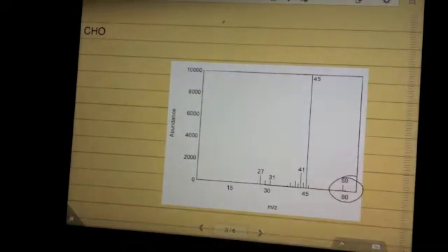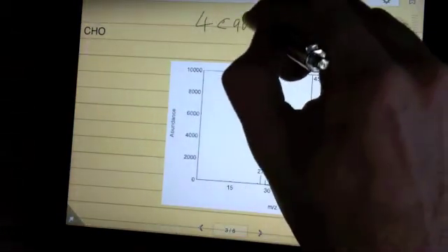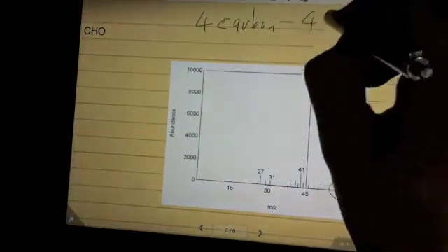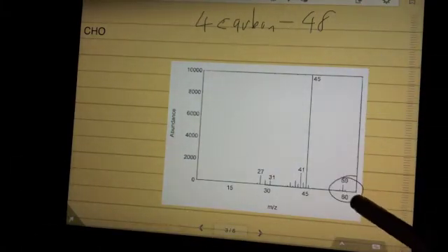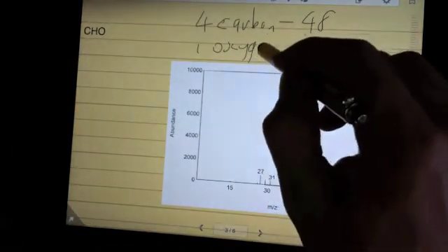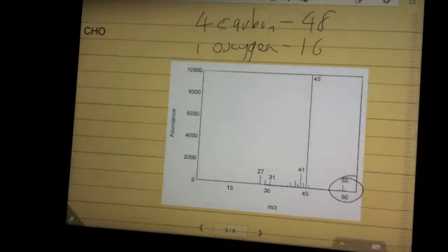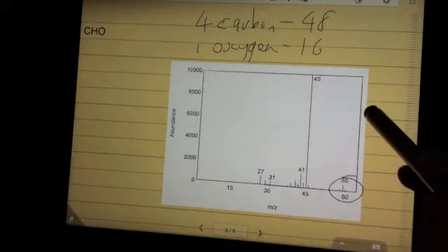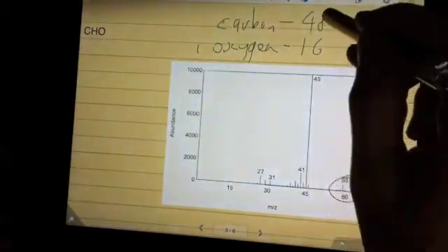We look at it. What could it be? Four carbons - four carbons gives us 48 because each carbon is 12. What else do we need to get to that? We've got an oxygen. So one oxygen - I'm just guessing here, just thinking of numbers which add up to be about that. One oxygen gives us too much, so it can't be that. Let's go back and do three carbons, that might be a bit better.